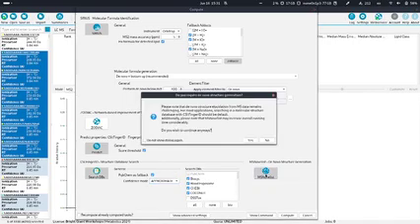What we also have here now is a new button for MS Novelist for de novo structure generation. If you click on this, you will have a pop-up which shows that you still should be careful with the de novo predictions of structures. Also, what is important is that the runtime increases if you do it for every compound. So it might be a good idea to just run it for some specific compounds.